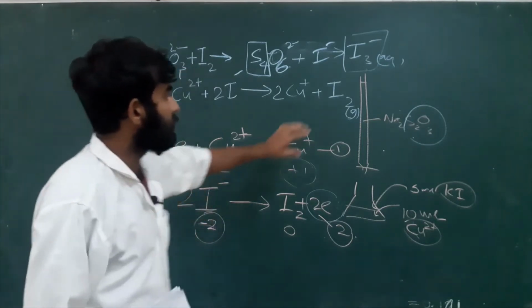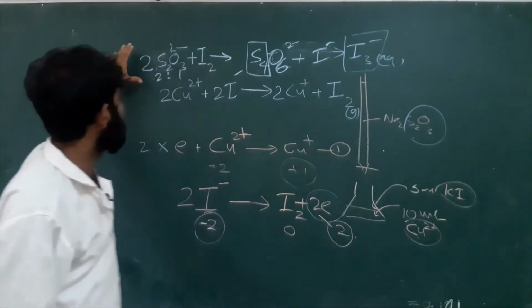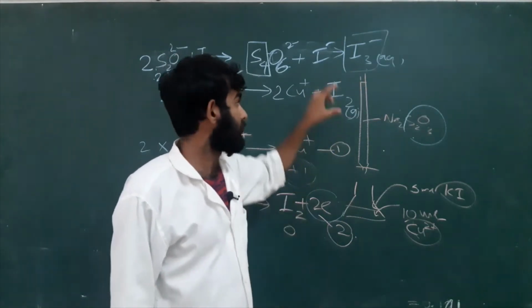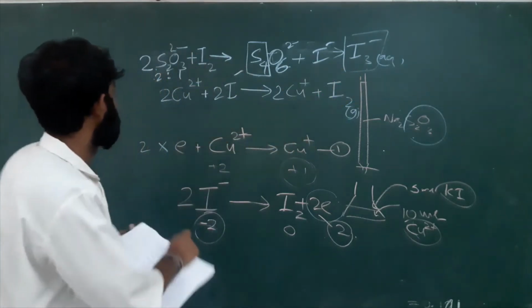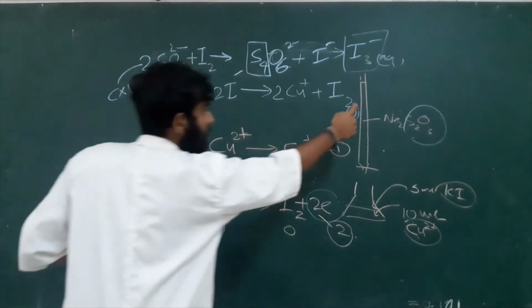So we know the concentration of sodium thiosulfate. By using that, we will read the volume of sodium thiosulfate used in the titration from the scale of the burette. So we know the concentration of thiosulfate and we know the volume, which we can read from this burette.